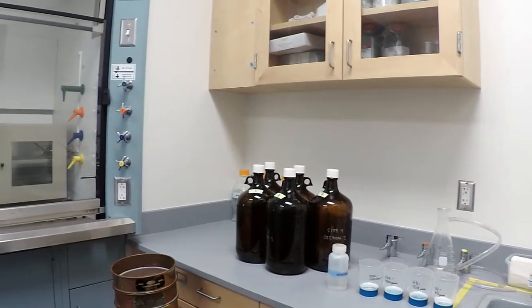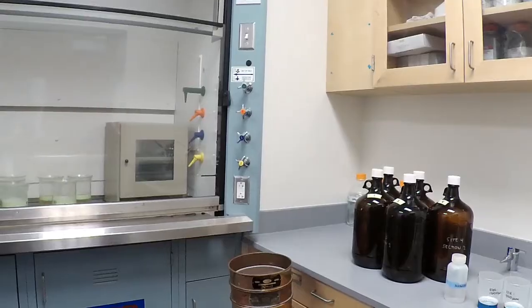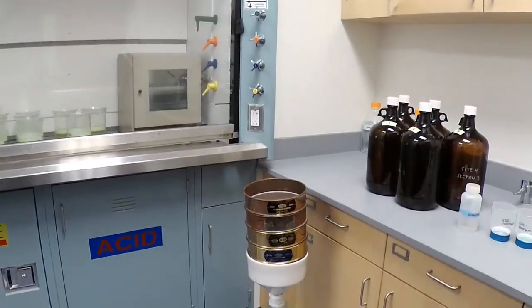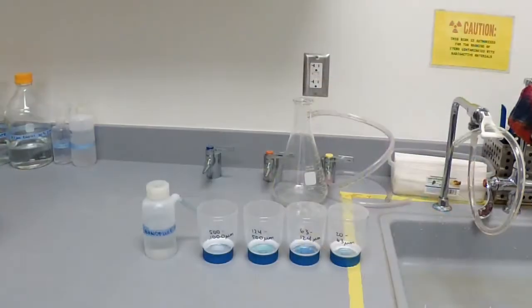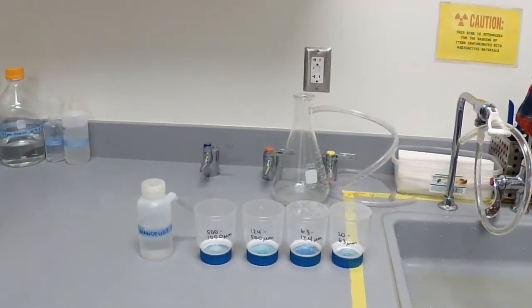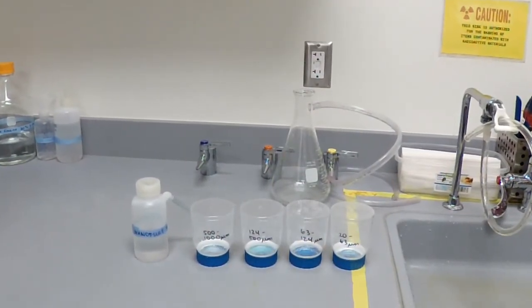To start the processing protocol, you will need to collect your 20-liter water sample stored in five 4-liter AMBRA bottles, as well as your various size stainless steel sieves. You will also need to prepare filtering units to collect the microplastics from each of your size classes.